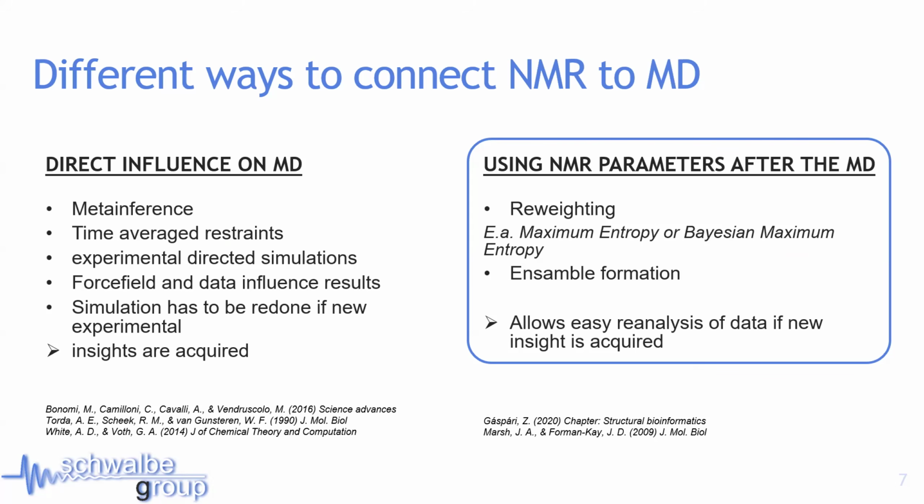The other option, which I will introduce today a little bit in more detail, is running an MD simulation, collecting a large number of frames, and then using our NMR data to reweight the structures that were sampled during the MD trajectory.